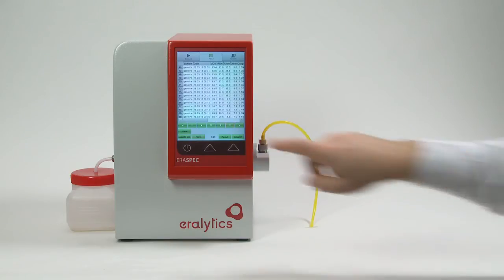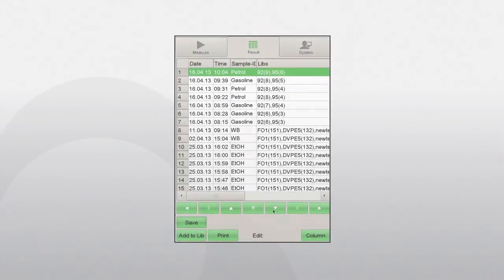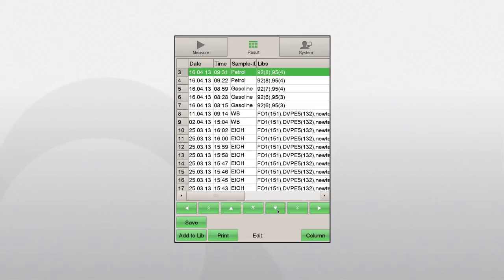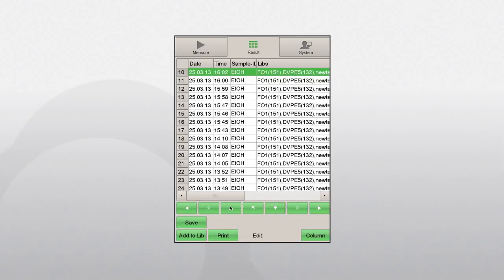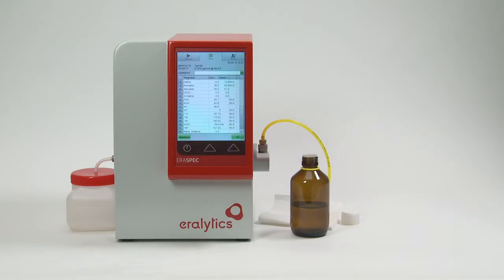Using the column button, you can select specific parameters you need to be shown in the result menu. Browse through the result memory using the cursor keys at the bottom of the list. To view the entire result list of an older measurement, press the box to the left of the desired result.